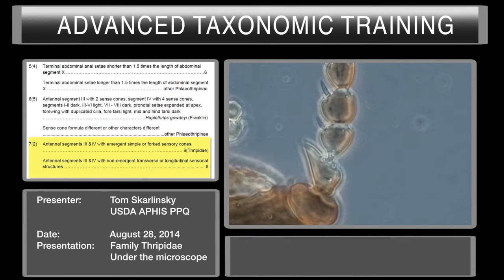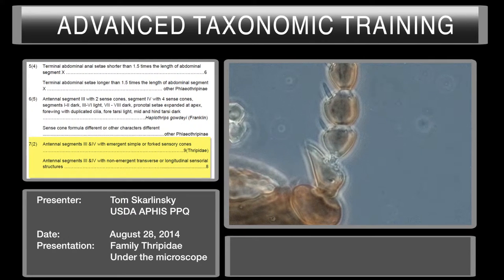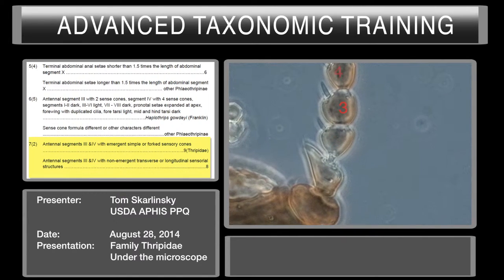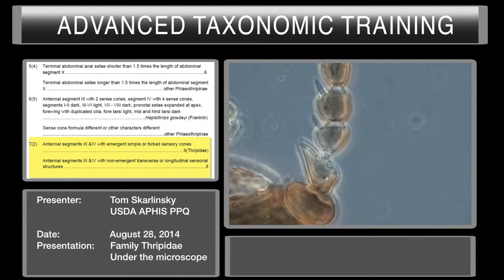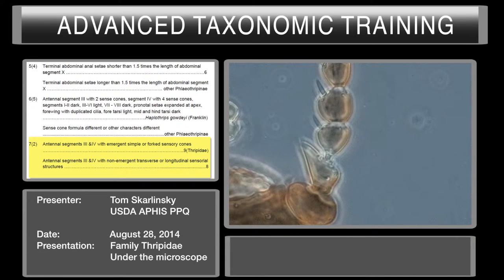Okay, here's an example of a simple sense cone on this other side. We've got segment one, two, three, four. So the question is: are they emergent? Are they simple or are they forked? This is an example of a simple sense cone.